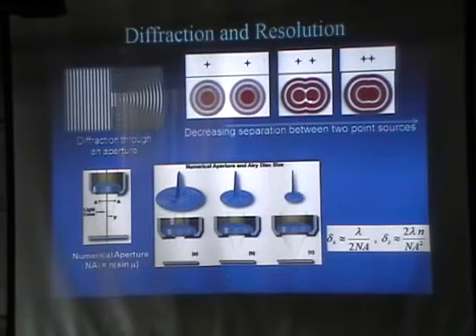And it's tricky because in these images we don't have noise. Ultimately, our ability to separate these 2 objects depends on the background noise. So that is something that only comes in the new theories of resolution, not in the classical theories.